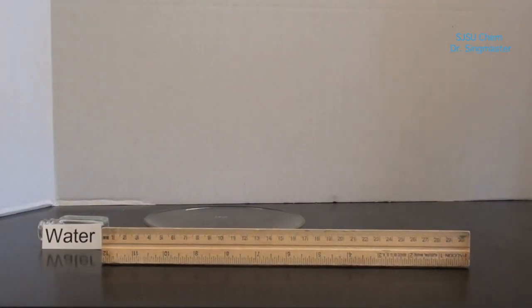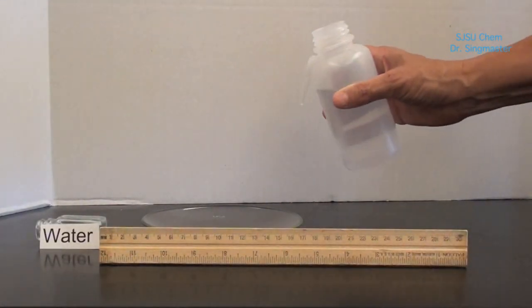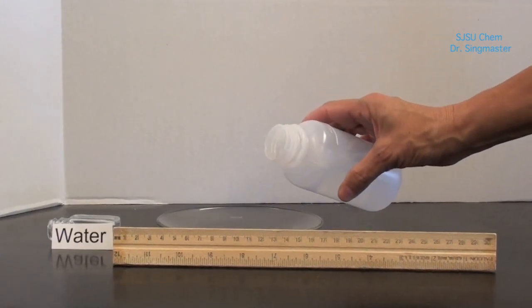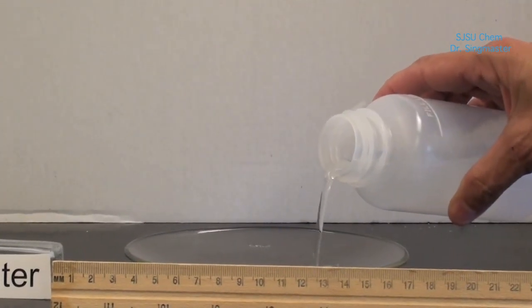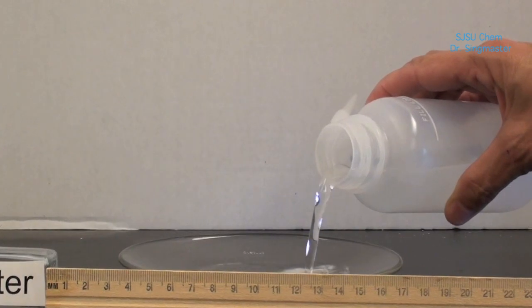Now we're going to create our layer of water where we're going to build the monolayer of stearic acid. So we're filling a watch glass with water.